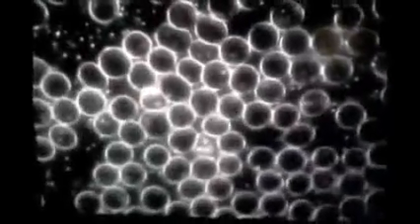This is a great improvement from the first stick because the blood cells are now able to move more easily and more quickly throughout the blood. This is what you like to see when a product gets right into the bloodstream. Again, this is 30 minutes after the sole product and I suspect a great improvement as the product gets more into the system.